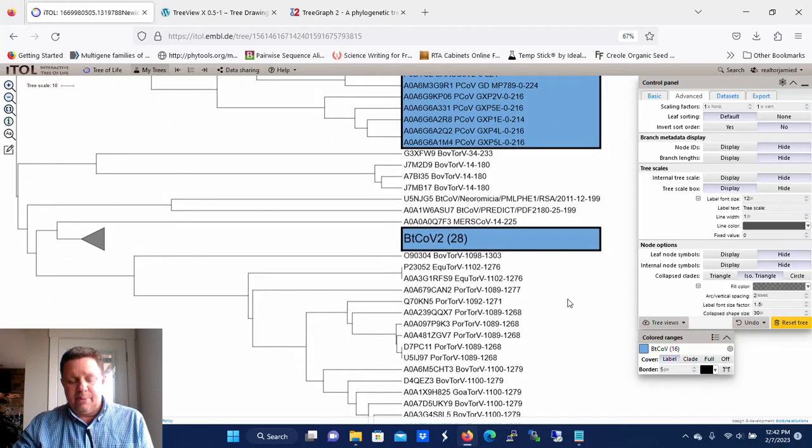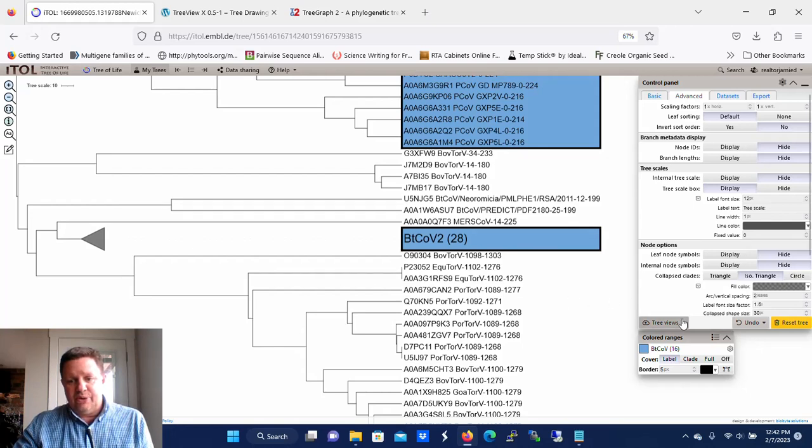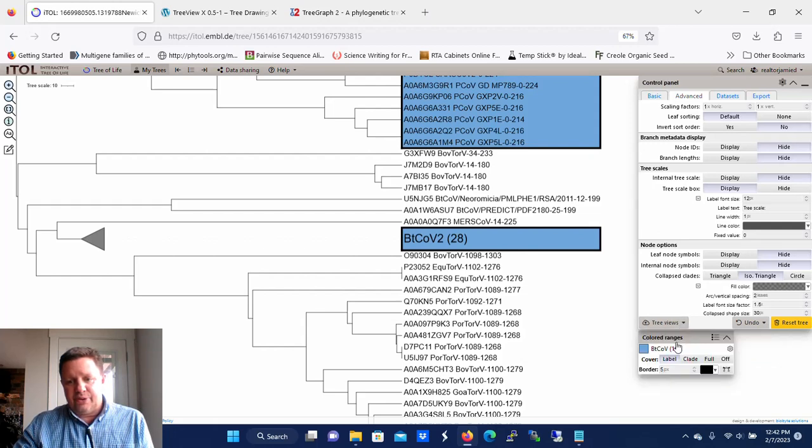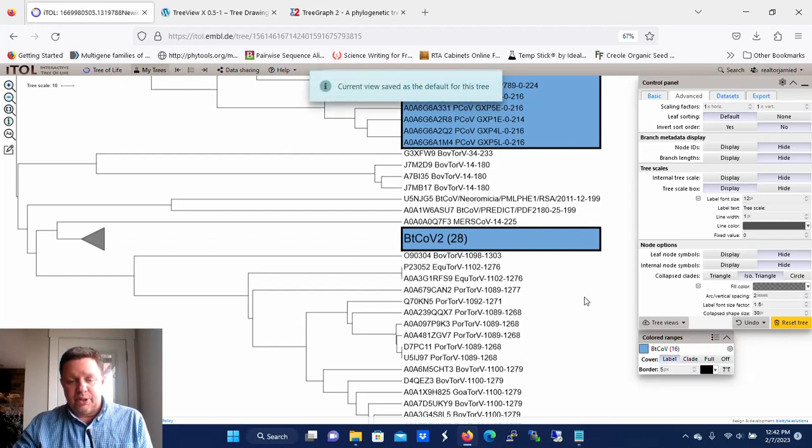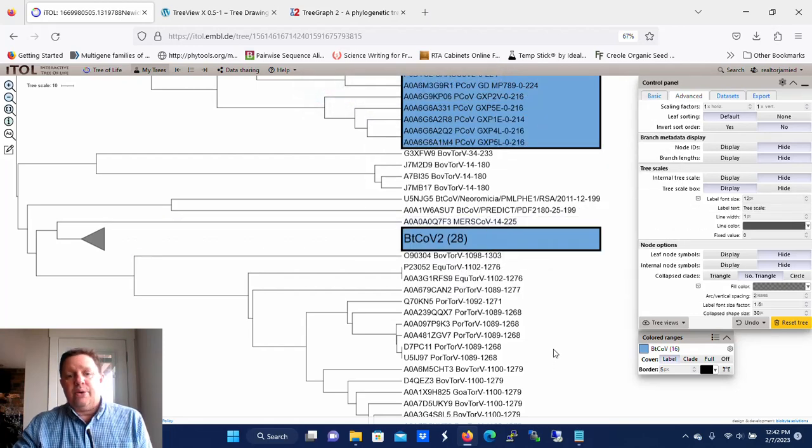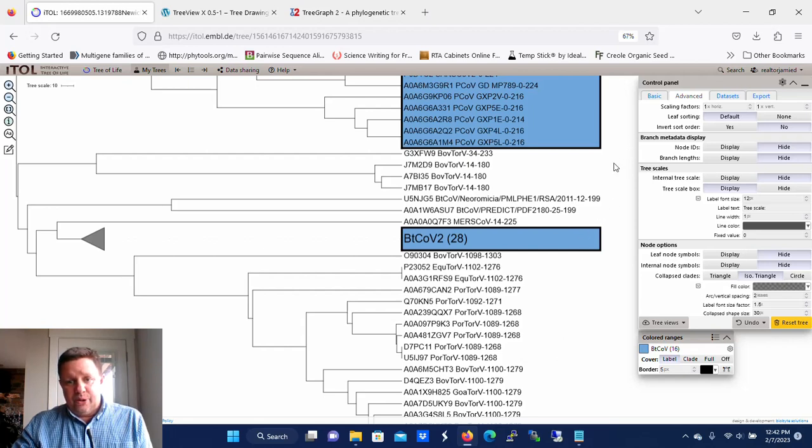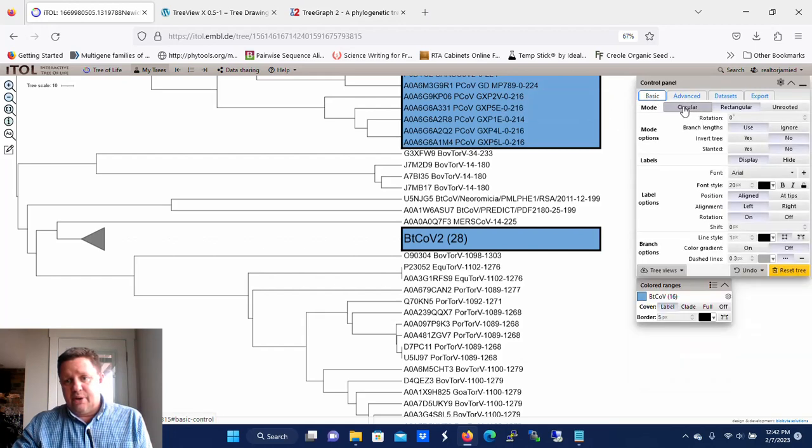In my opinion, this is one of the flaws of this program. But what you got to do is you got to go here to Tree Views at the bottom of the control panel and click Save as the Default View for This Tree. Make sure you do that a whole bunch because if you don't, the way that you have set it up and how you want to view it is just going to go away when you log out, and it does automatically log you out after a while.